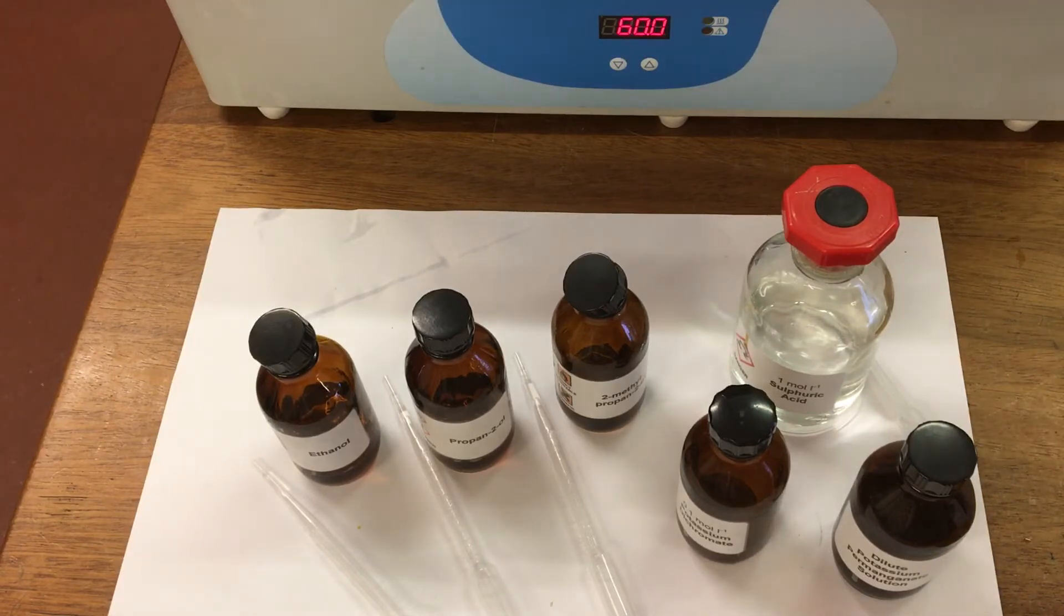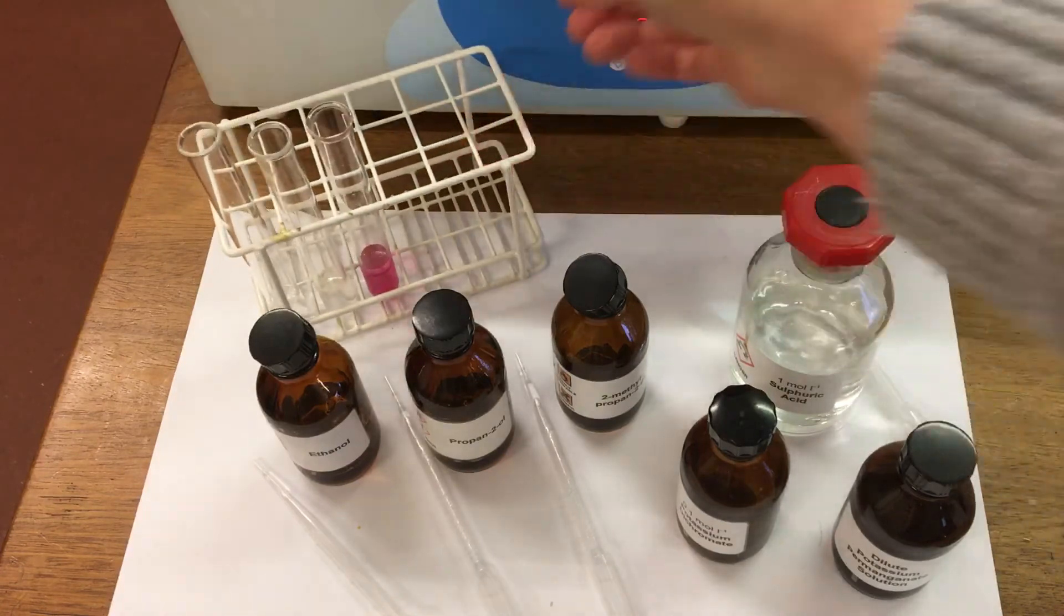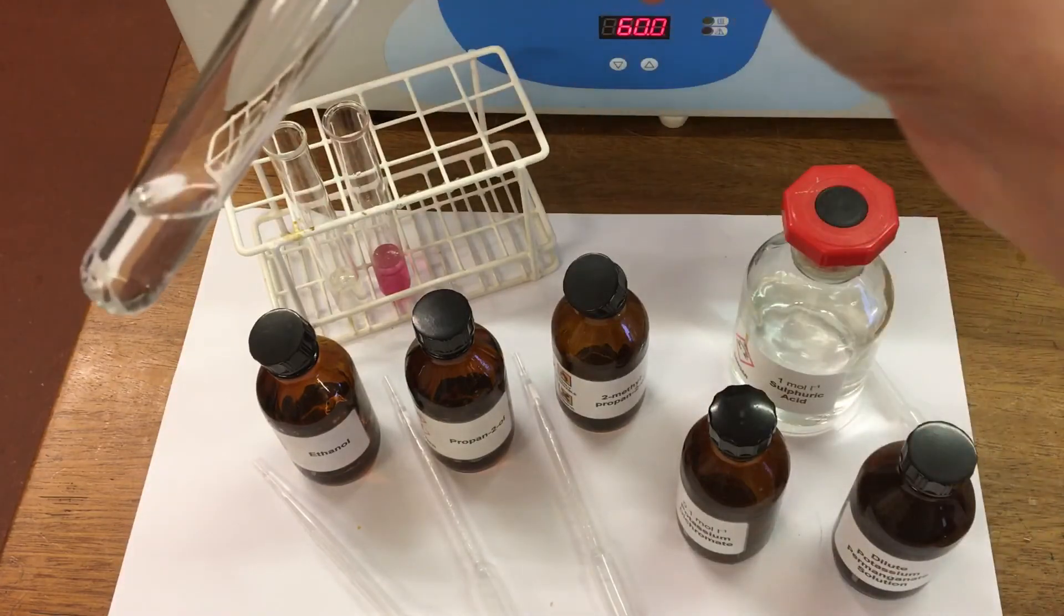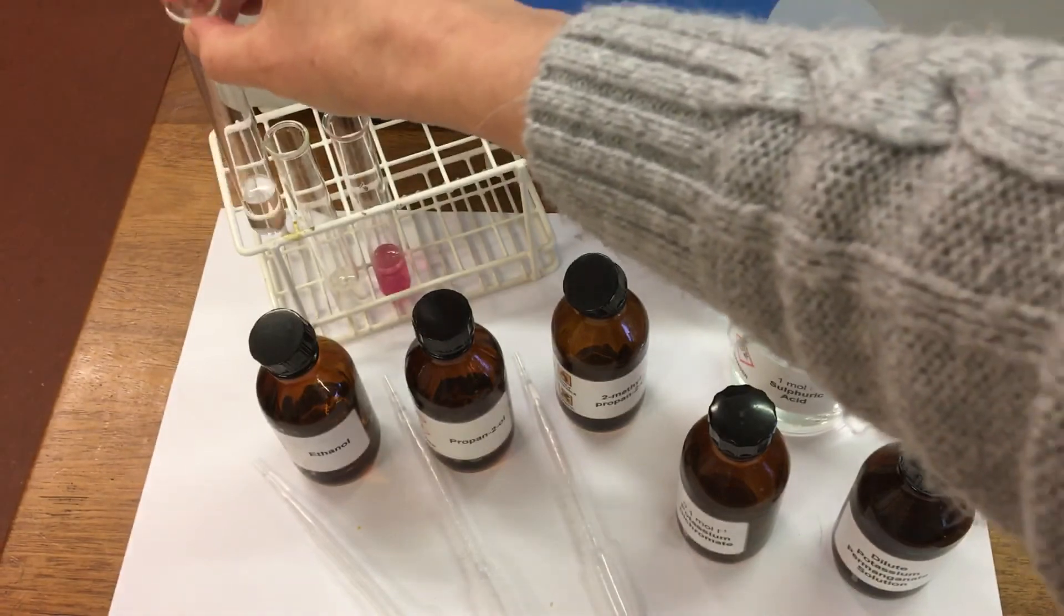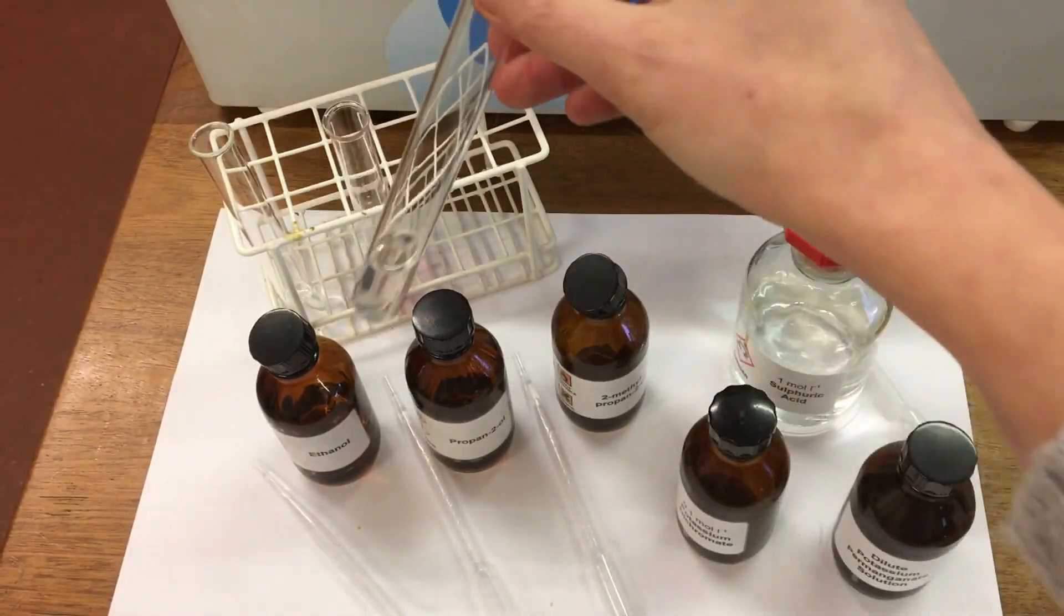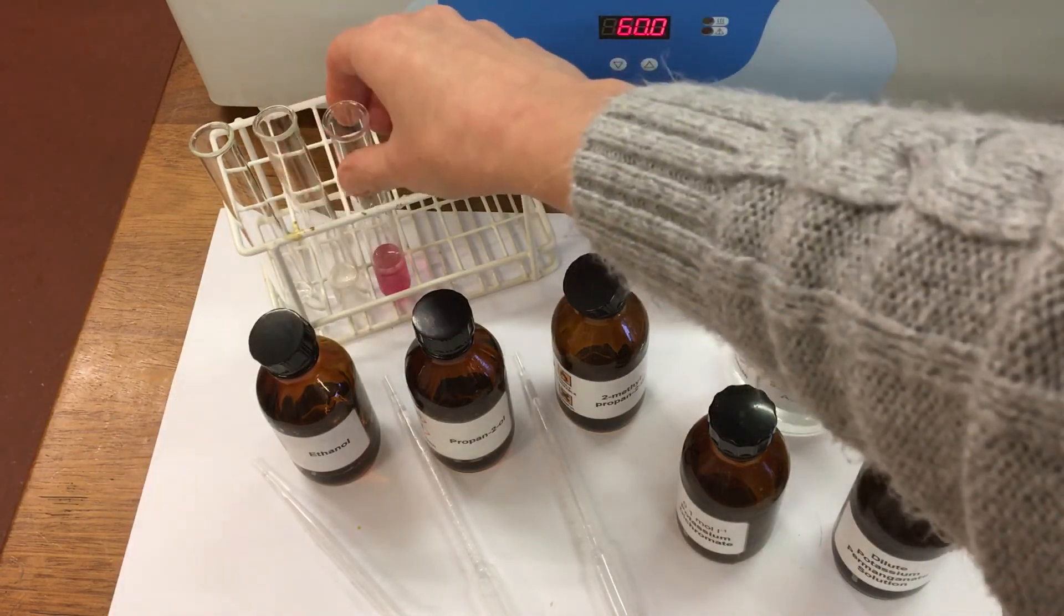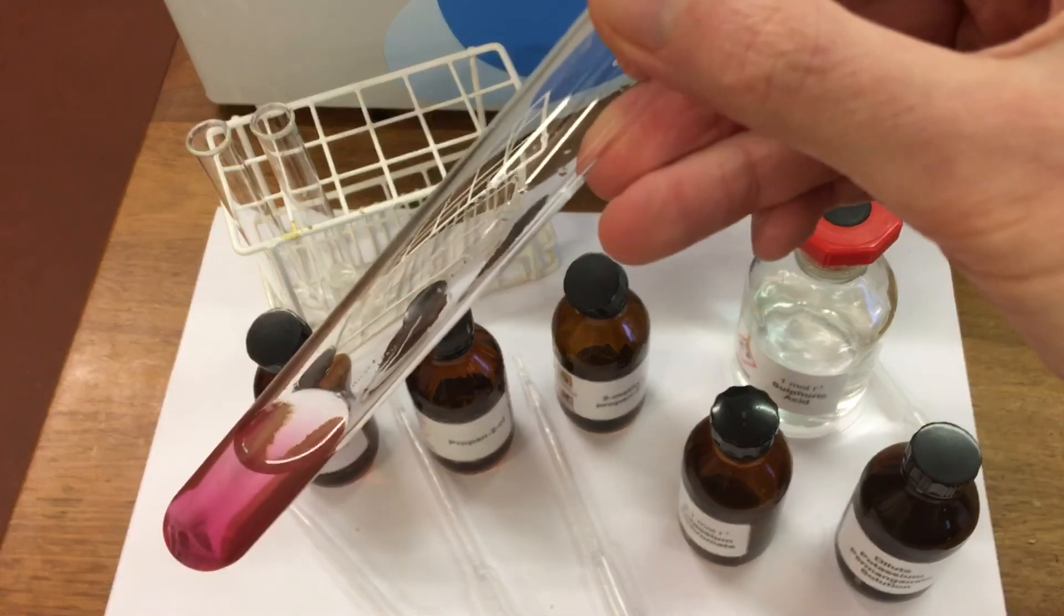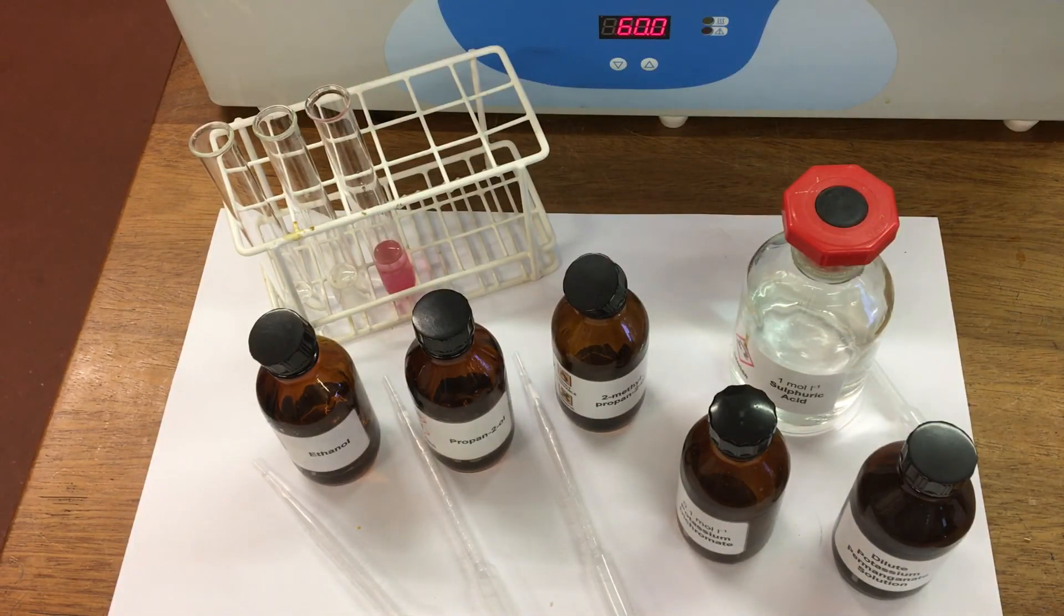So after a couple of minutes, we'll look at the results. So for this one, we've got our ethanol - it's gone completely colorless, so that one's oxidized. Propan-2-ol also has gone colorless. But our 2-methylpropan-2-ol, we've still got the purple color of the permanganate. And then we're going to just get some light and then put them on display.